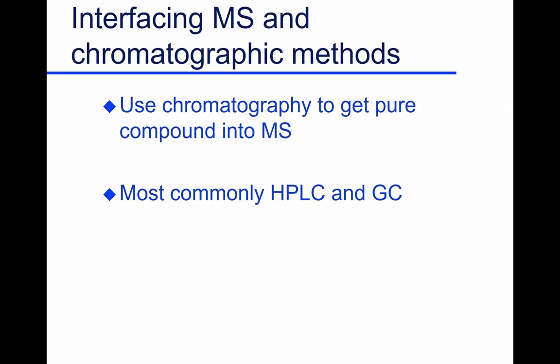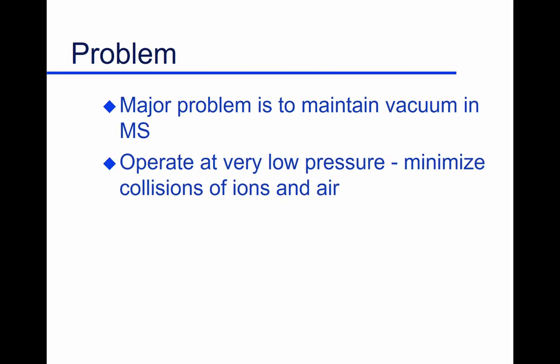But it's not a simple interface. It's not trivial in any sense of the imagination. It's taken a number of years to work out how we can make these instruments compatible. And one of the biggest problems truly is we have to maintain a vacuum in our mass analyzer section. That section operates under a vacuum. And it's like 10 to the minus 6 millimeters of mercury. So it's not a trivial vacuum. It's one darn good vacuum.